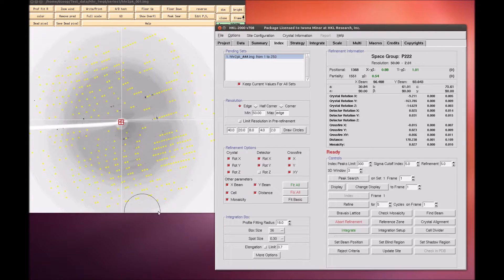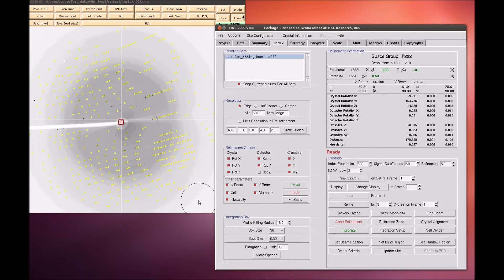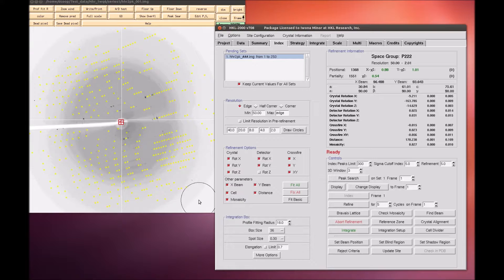At this point, the peaks displayed on the image are color coded. Reflections that are recorded completely on this image will be green, whereas reflections that are split between more than one image will be yellow. These reflections will be combined during the scaling process. Reflections that are red have been rejected.